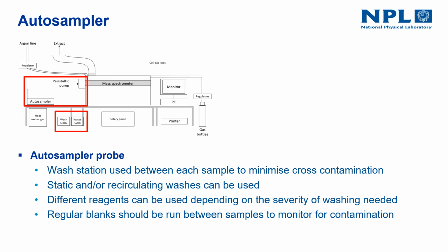In some cases, the ICP-MS software will be equipped with a feature where the wash will run until a threshold count value is reached for either an interference or the analyte, so that perhaps at the start of the run, when the instrument is relatively clean, the wash time will only have to be, say, 2 to 3 minutes to reach the threshold blank value that is required before moving on to the next sample.